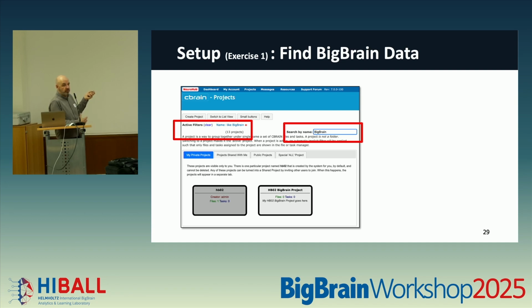So by creating this search field and filling it out, you're actually applying filters to the data space or the searches that you're running. And it'll identify what you've applied as a filter. In my case, I typed in BigBrain, and it marks it as a filter. If you ever want to get rid of the filter and go back to a plain, flat view of everything, you just clear the filters. Or if you have multiple filters, you can click the little X next to the filter name, and that'll remove it from your view, okay?